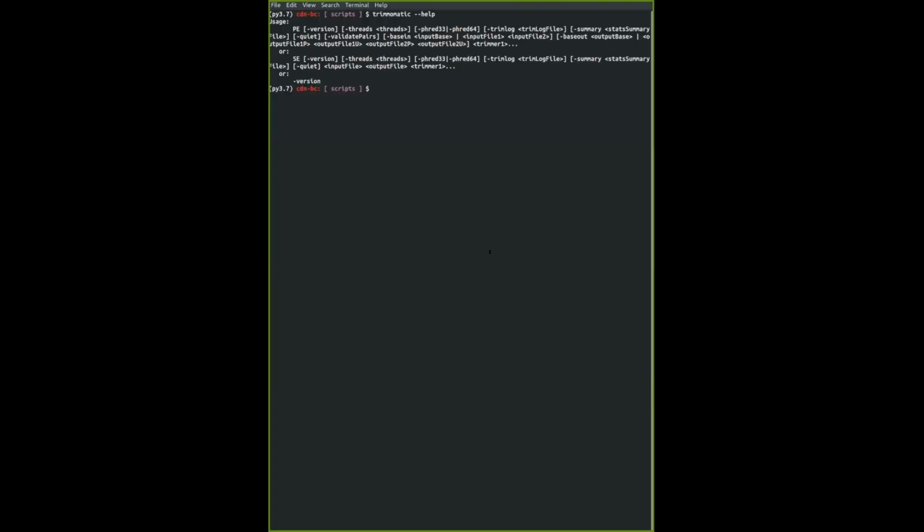I don't think I have this file. So share screen. Okay, so I'm here. Just check my scripts directory. Yeah, I don't have these two files, so I'm also going to download them together with you. So just simple paste. I'll paste the first one first.